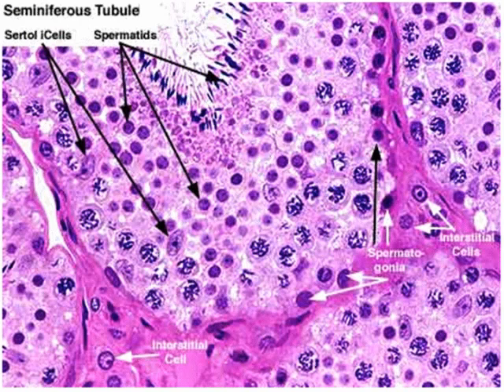Now, on our next slide, this one is a different slide. I actually pulled this one from a Google image search, which you can always do on these slides, and it's amazing what you can see. But in this one, they have the cells actually labeled for you. So you can see there's spermatogonia. So here would be one, here would be one. And then they don't have the primary spermatocytes labeled here, but there they are.